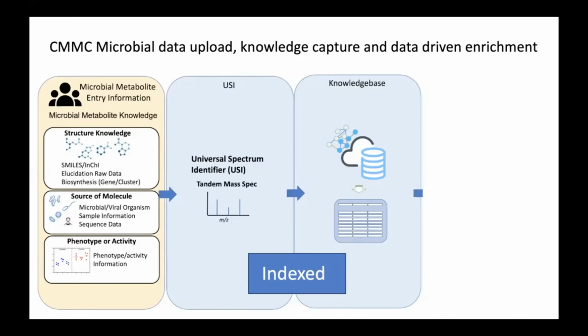So this could be in our own ecosystem, which I'll highlight in a second, but it could be in Metabolomics Workbench, it could be in MetaboLights, it could be in PRIDE. Wherever the data is stored, we can create a universal spectrum identifier, and it reports on the project, the files that it's in, as well as the individual spectra associated with it, so that now we have a hard data linkage. And so these USIs are also captured to a larger knowledge base, and all of this is indexed.